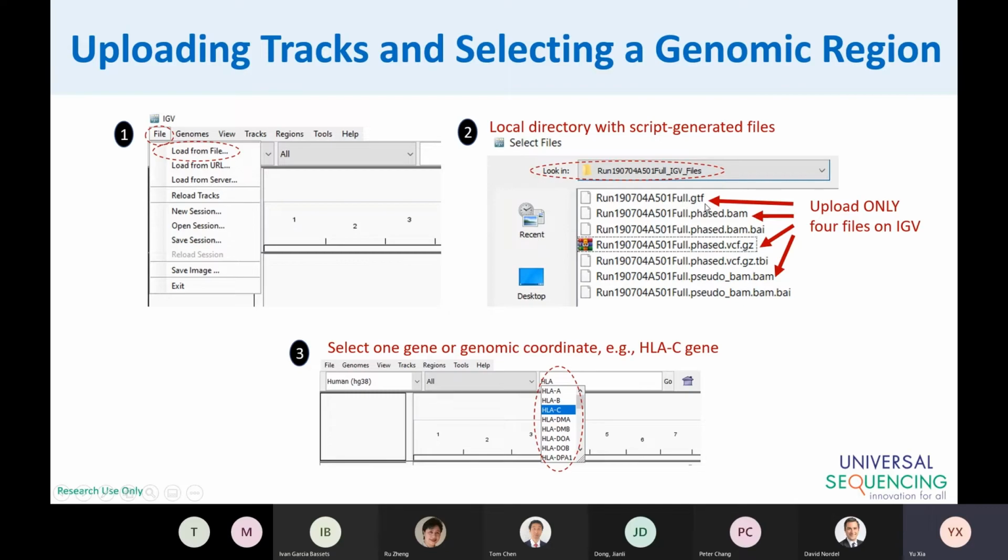And if we enlarge this portion, this portion, this portion, you will see something like this. So this G linked to this A, linked to this reference, this reference linked to this C. And then this shows the detail in the read BAM track.